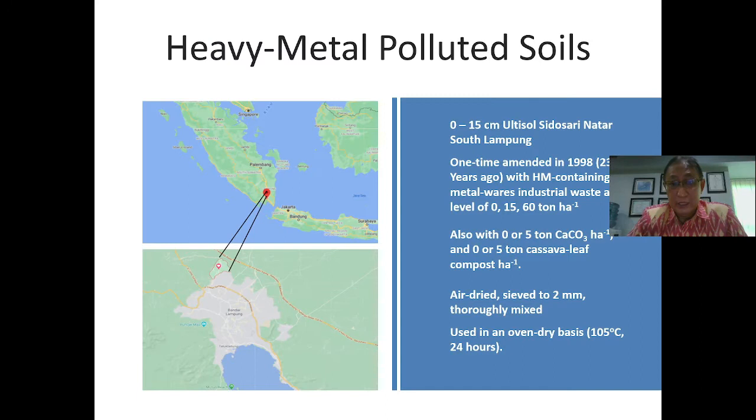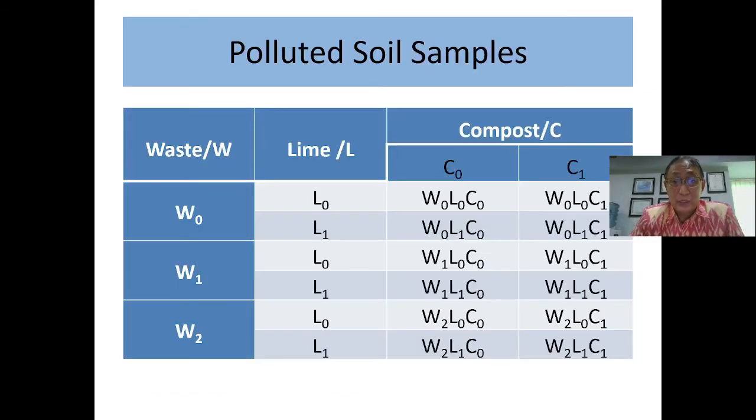and zinc. The soil samples we use actually were collected from an experimental plot set in 1998. And the soil sampling was conducted 22 years after the soil amendment with heavy metal containing waste, calcite, and cassava leaf compost.